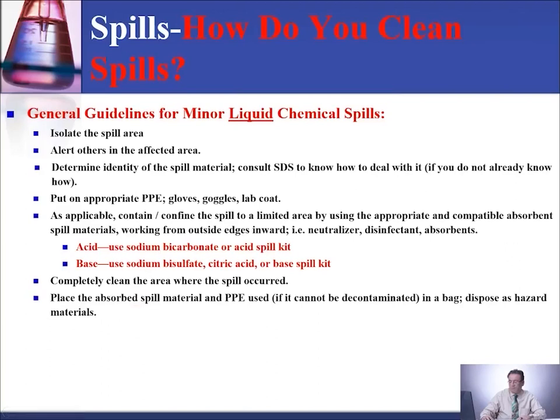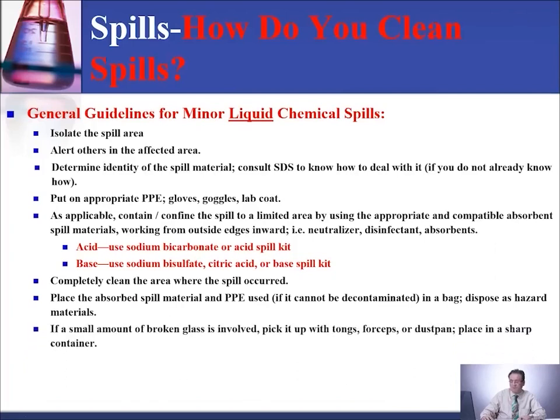Place the absorbent spill material and PPEs used in a bag. Dispose as hazardous material. If a small amount of broken glass is involved, pick it up with tongs, forceps, or a dustpan. Place it in a sharps container.